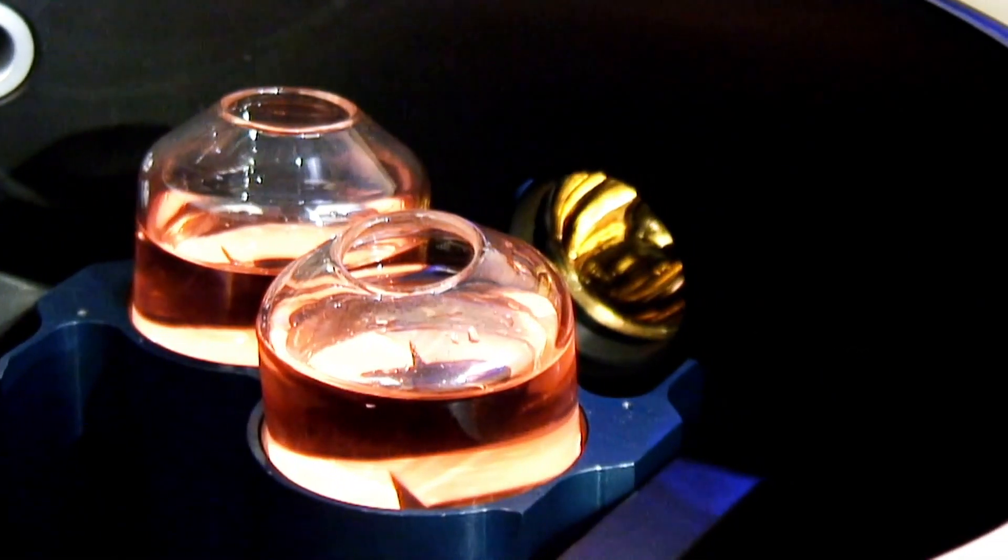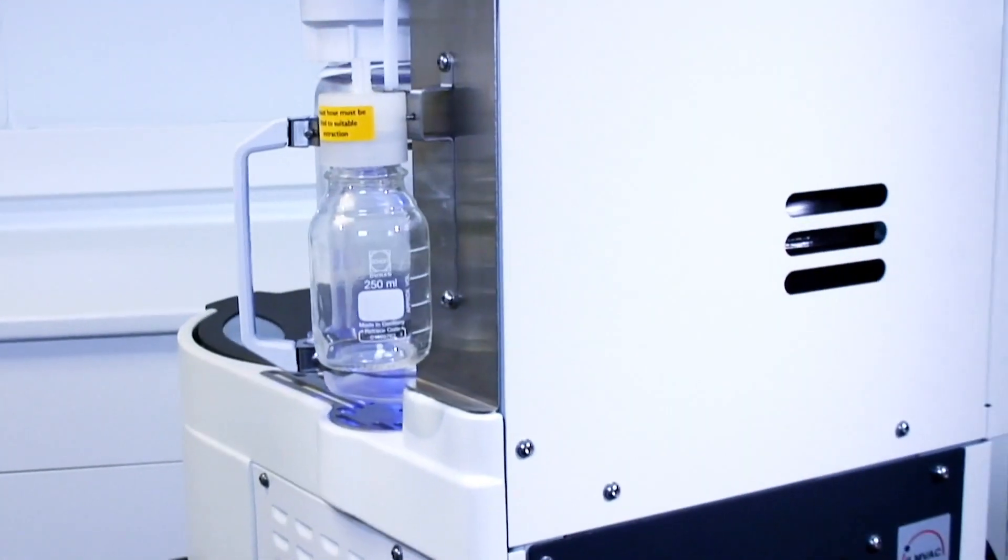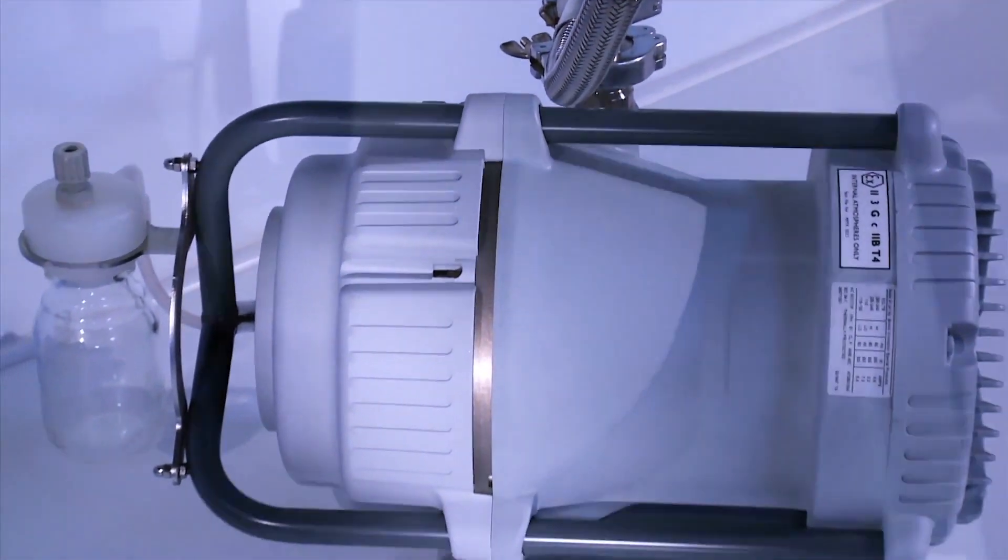The samples are spun in the centrifuge and as they boil, vapors are drawn to the cold trap which condenses them. A vacuum is created by a robust oil-free solvent resistant vacuum pump.